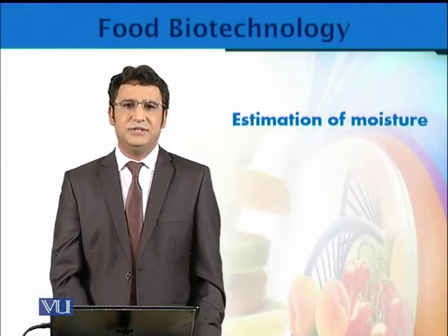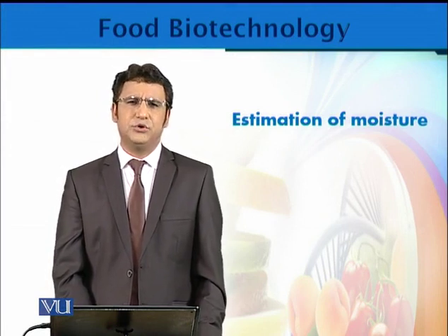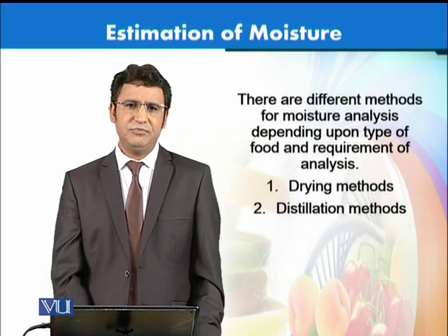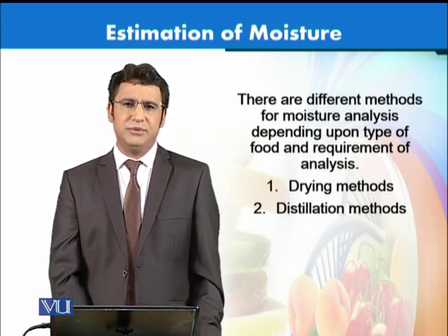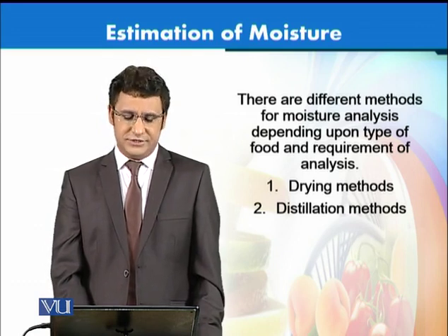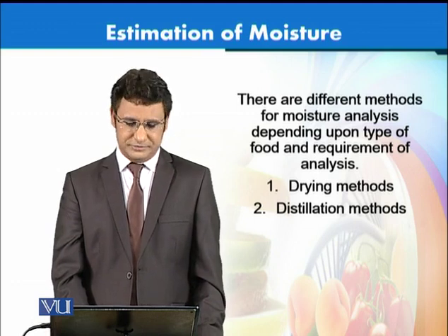Let's talk about food analysis called estimation of moisture. This is a routine food analysis done for different reasons. This analysis can be categorized into two different techniques called drying methods or distillation methods.